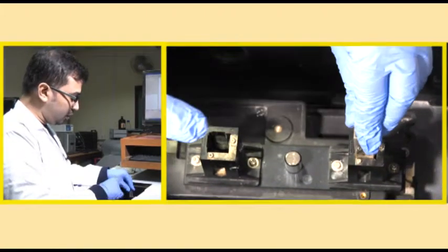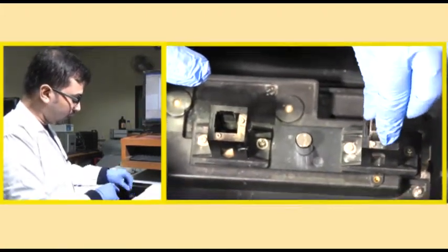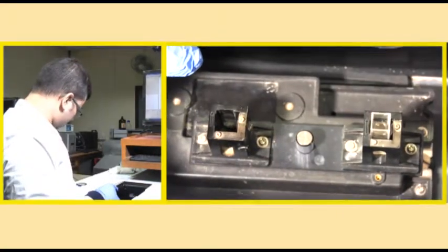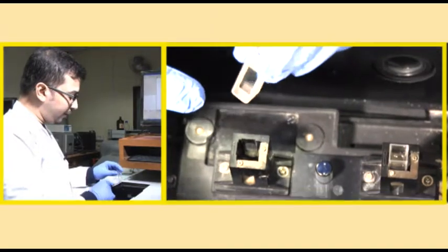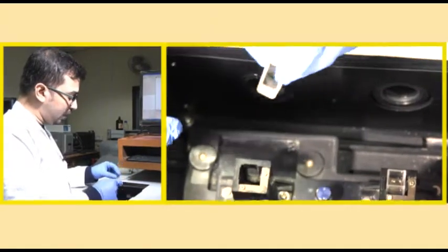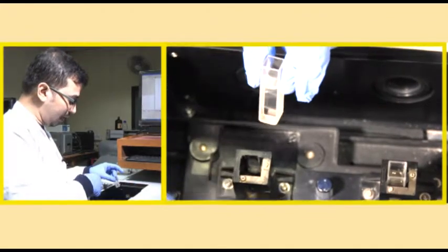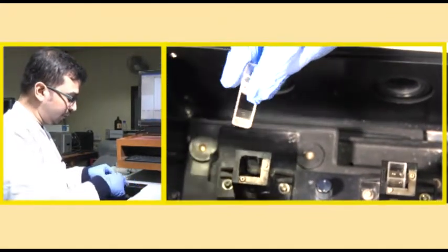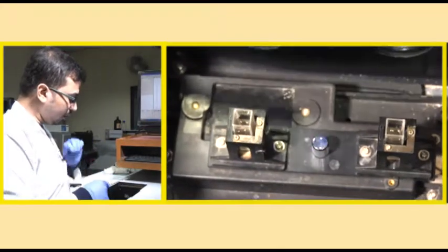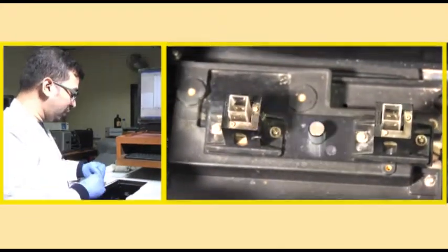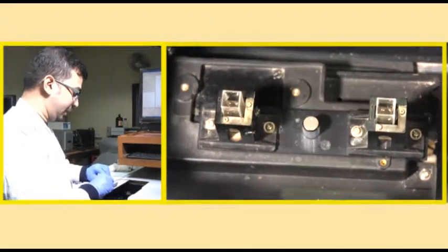We are placing the cuvette in the sample chamber such that the clear side faces the light passing from one side to the other. Similarly, we are taking the reference cuvette, cleaning both sides, and facing it so the clear side receives the light. The light enters from one side and passes through to the reference compartment. Now let us move towards analysis. Before beginning the experiment, we need to close this lid. Do not keep the lid open while doing the experiment.